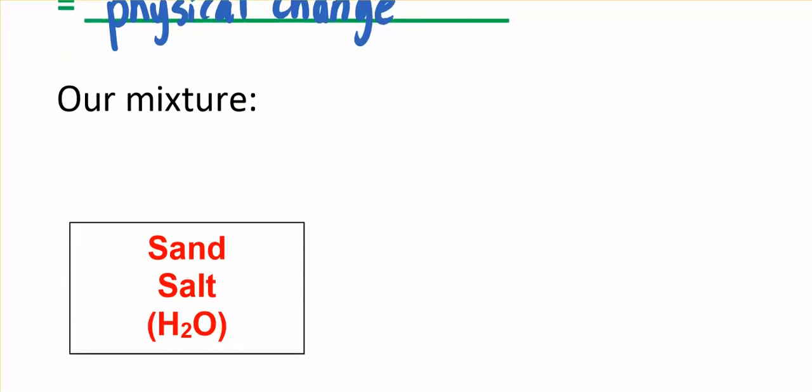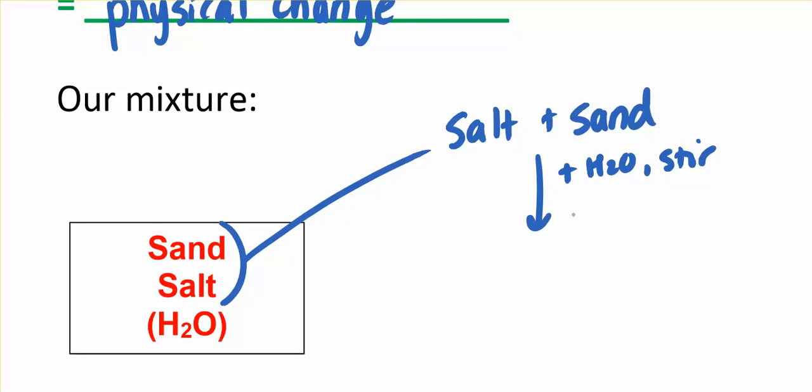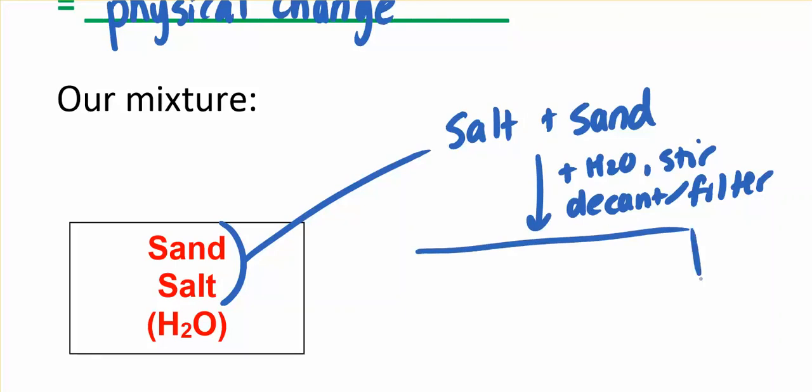We're going to start with just the salt and sand. You're going to add water, stir, decant or filter, and then you will have wet sand and salt water.